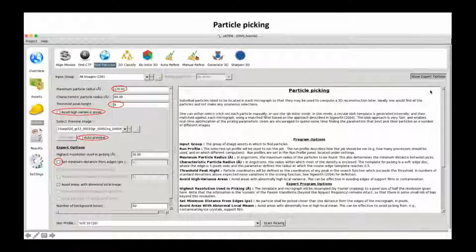So the next step, we should just go here to actions again, the tab on the left side. Then we go to find particles and show display expert options, and that's what you're going to see. What is also great about this system is that we have this menu on the right side that explains in very simple language.